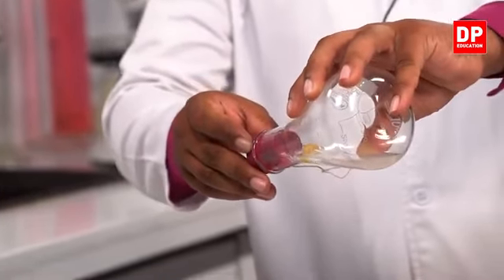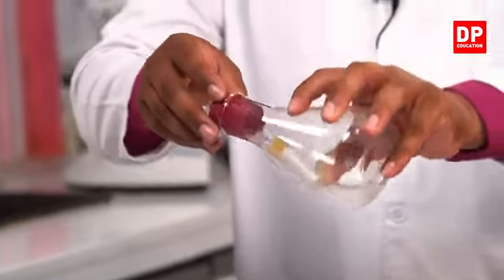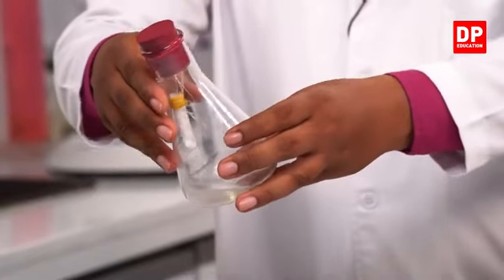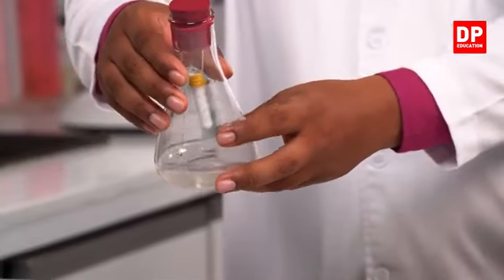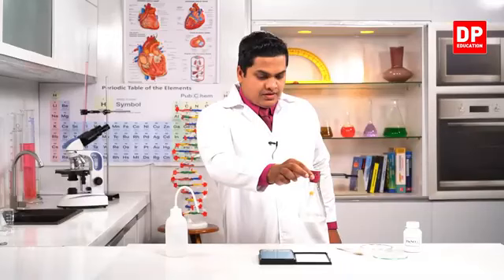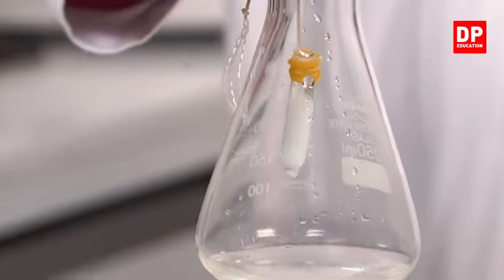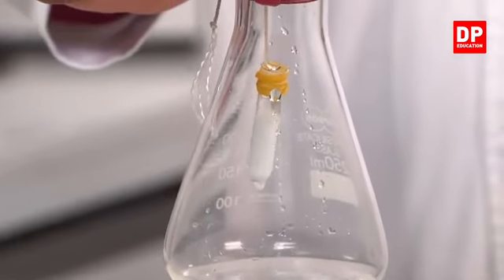Right. Now I'm going to take this one up and mix the sodium chloride with the solution here. Right. So here you can see it very clearly. There is a chemical change and there is a precipitation inside the ignition tube.